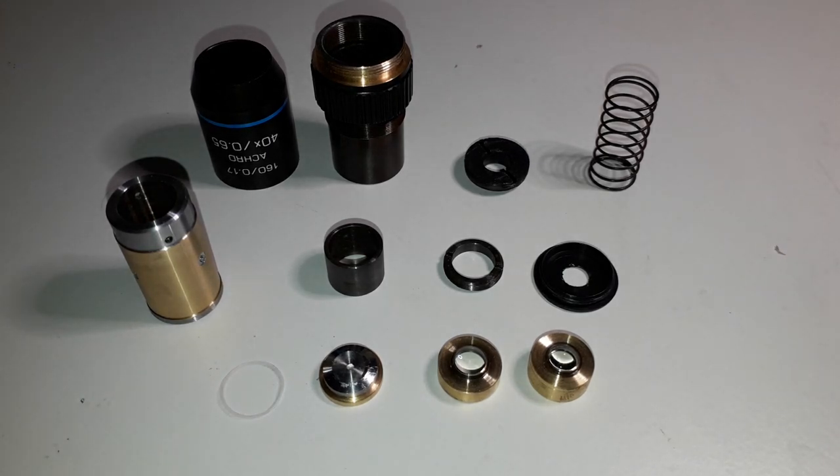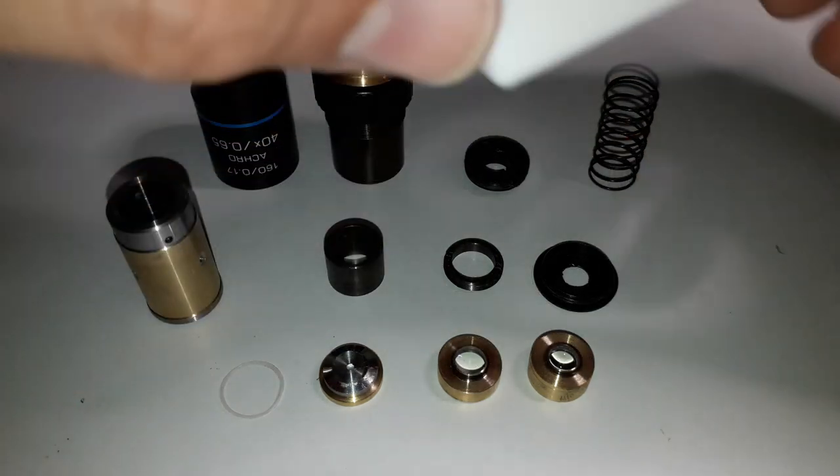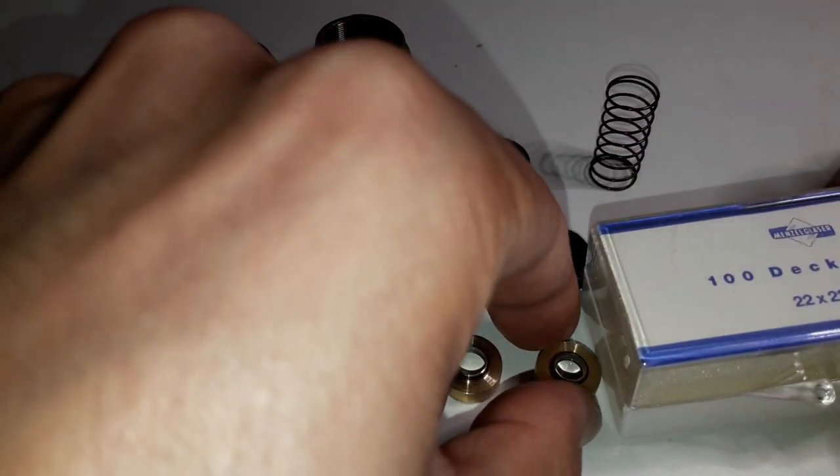Different objectives, of course, have a different design. And I also wanted to show: you can actually see that the small convex lenses do actually magnify. That's basically all I wanted to show you right now, and I put everything back together again.